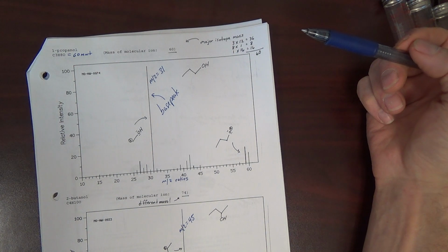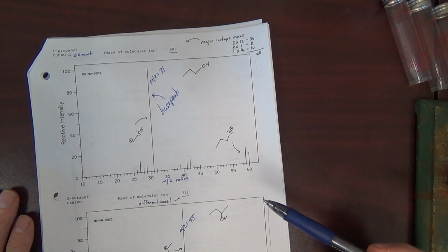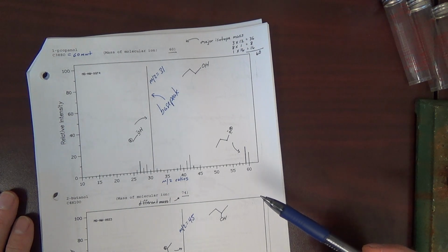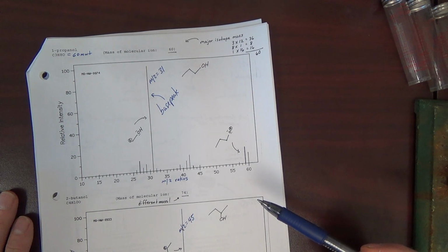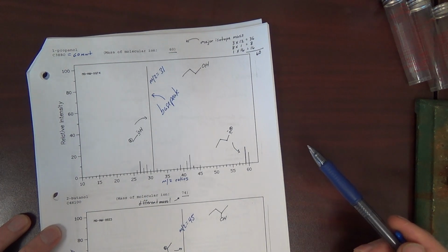Okay, so on the next page we'll look at basically the instrument and talk about how do we get peaks in the mass spec.